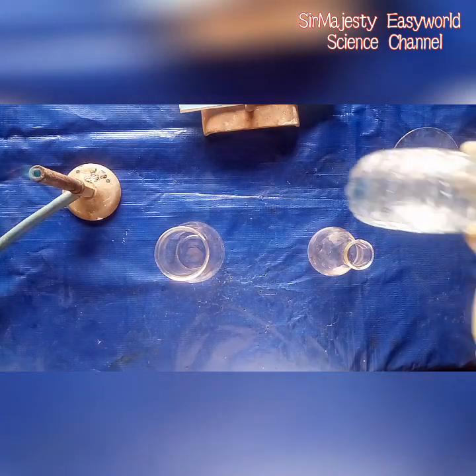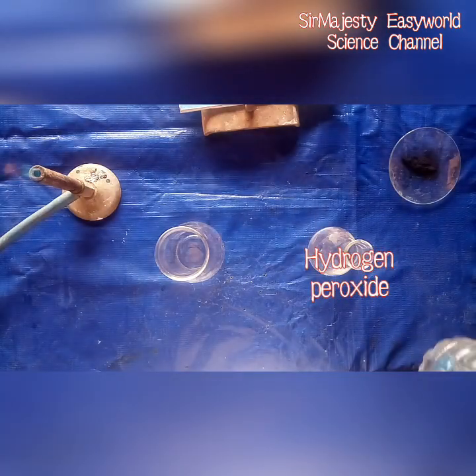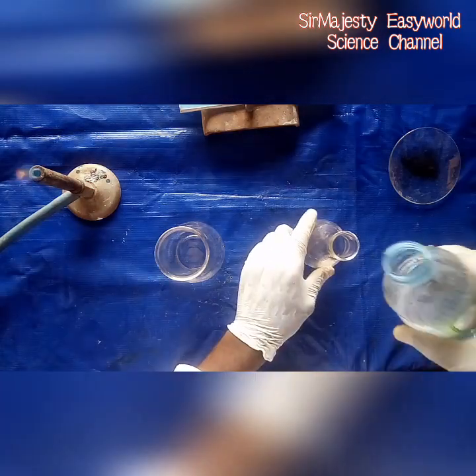Another reactant over here is hydrogen peroxide. So we need two reactants — actually it's only one active reactant: it's hydrogen peroxide.